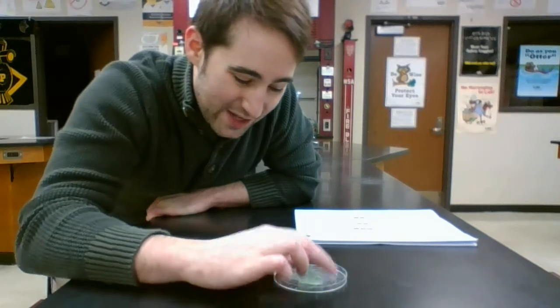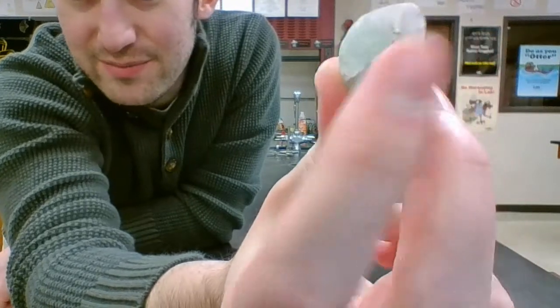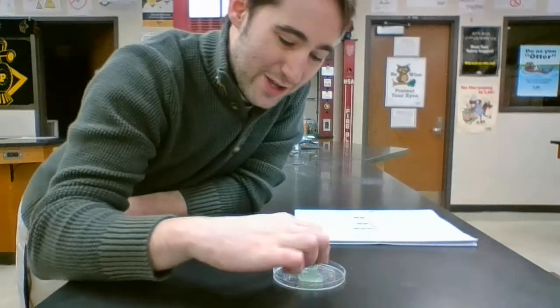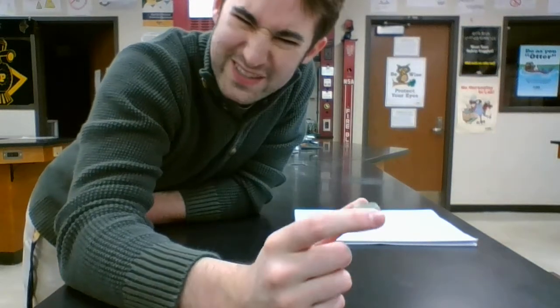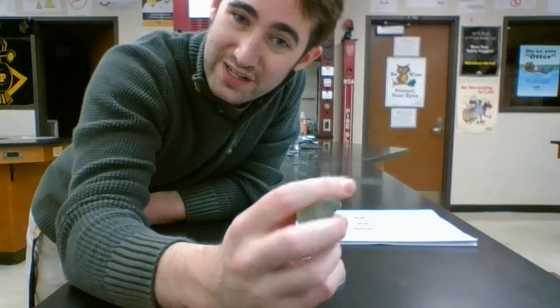Okay. Now you can also try and figure out whether this is a pure substance or a mixture. In this case, if you get kind of an impure piece, like this guy, sometimes you've got some little bits of stuff, other rock fragments that have been stuck in the sample, but we're considering just the fluorite here, okay, not other little bits and things that might be stuck to this. So just the piece of fluorite here is what we're looking at.